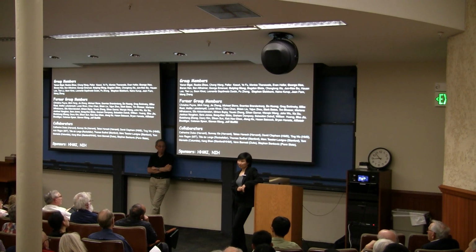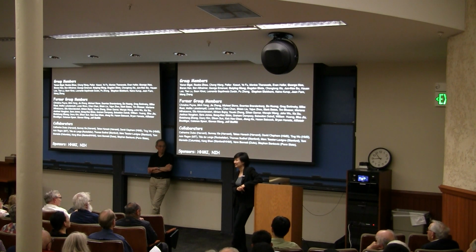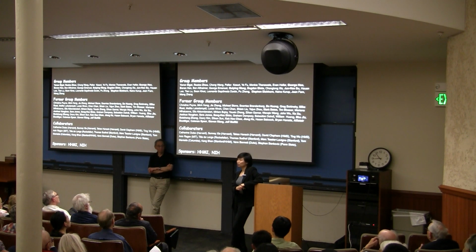So maybe just to clarify a little bit, I will answer that, but I want to clarify at the beginning that it perhaps is not entirely accurate to say that most of the biological processes cannot be studied, because a lot of the time the light penetration depth and so on is allowing us to study not only cell cultures, but also live tissues and so on.